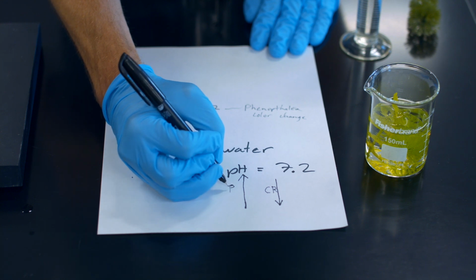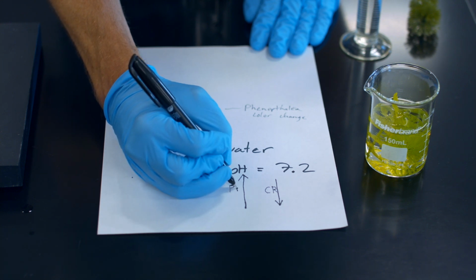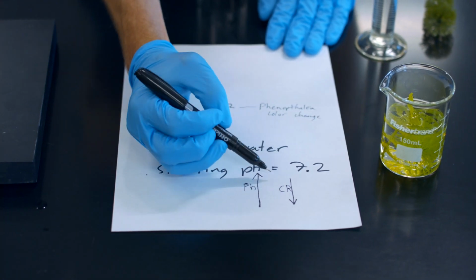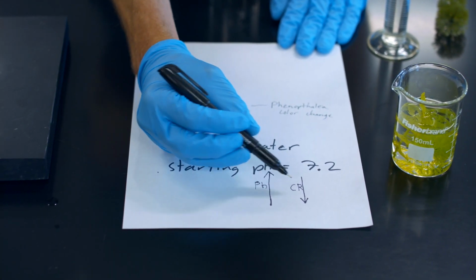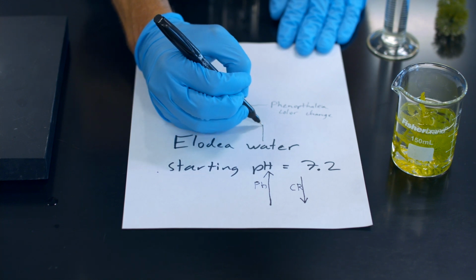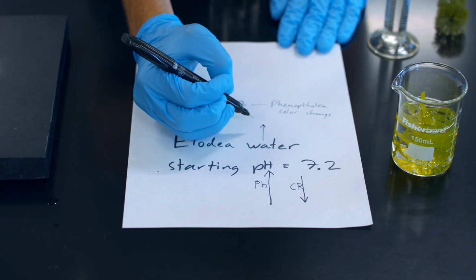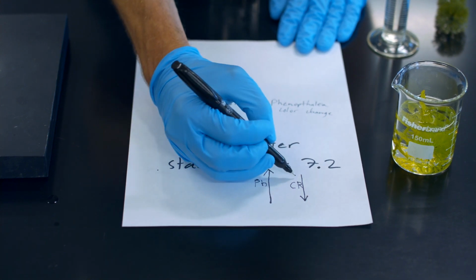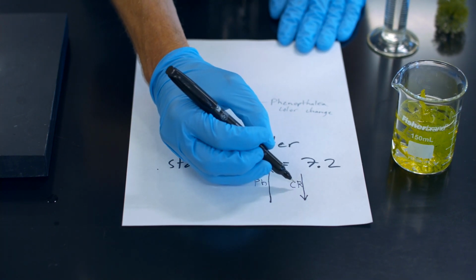Which direction does that P go? I don't know, photosynthesis. Good enough. Then photosynthesis going up. If we are doing more photosynthesis than cellular respiration, that pH will come up towards 8.2. If we are doing less photosynthesis than cellular respiration, that pH will get further from 7.2.